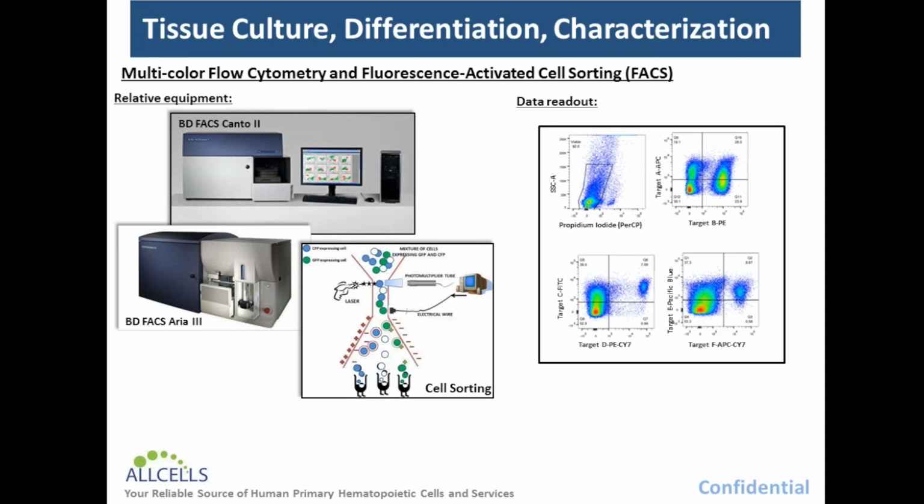In addition, with certain types of cytometers, cell sorting can be performed in which subpopulations are isolated from the parent population for subsequent culture or processing. Additionally, there are a multitude of diverse flow cytometry-based assays that can be used to determine the density of a certain membrane receptor or the cell cycle phase of a certain rare subpopulation.